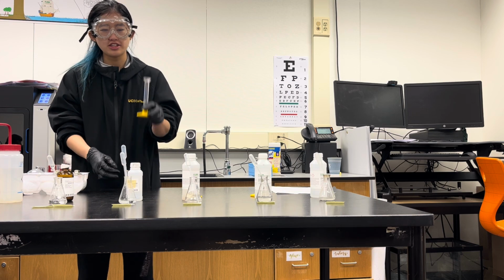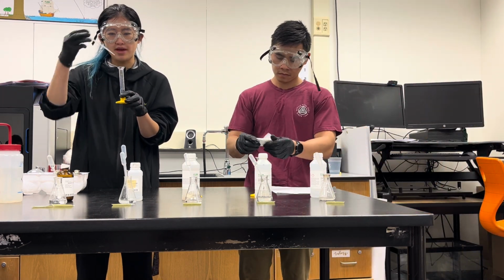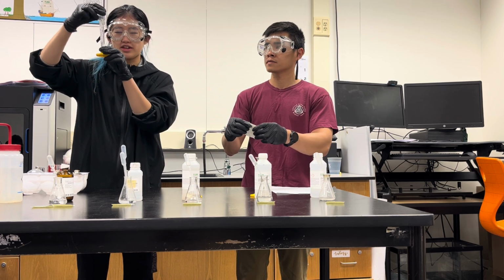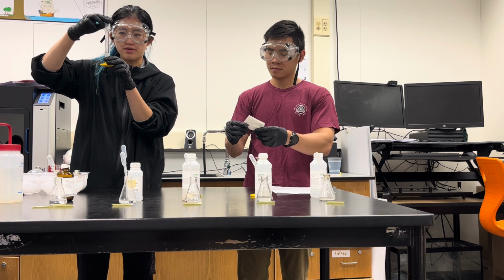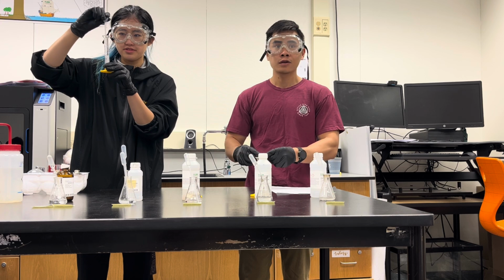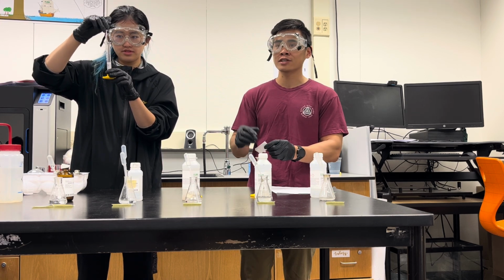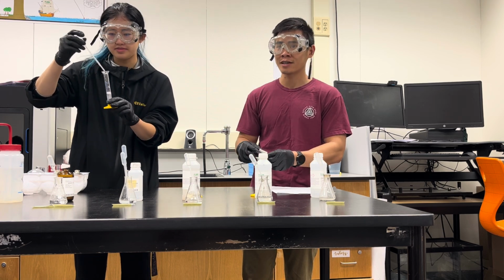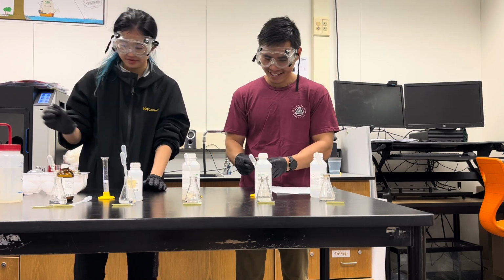Okay, so y'all just saw me put 2 chemicals in here. To mix it up, I'm gonna take a pipette. We're gonna suck up the mixture and then push it back. See how it's like mixing those 2 things together? Just so it's ready for the chemical reaction to occur. When you're thinking about lab safety for this part, be very careful with this, especially with how fast you decide to suck it up and treat it back out. Okay. All right.